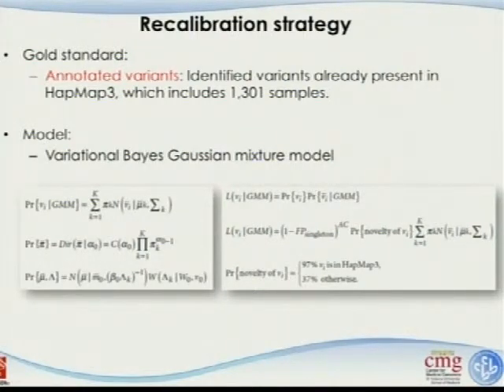It looks pretty confusing, but it's very similar to regression. When statisticians look at this, you guys just go ahead and get the paper. I promise it won't take you more than 5 minutes to figure this out. I just don't think this is the right place to talk about this. You can also use other tools, like support vector machines or neural networks, and other machine learning tools to improve this, but this happens to be the way they are doing it. Using those equation parameters and variables, train the machines, get a new variant, and let the machine decide what is good and what is bad.